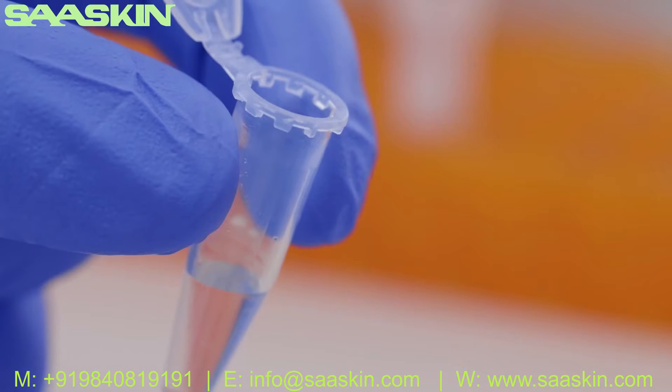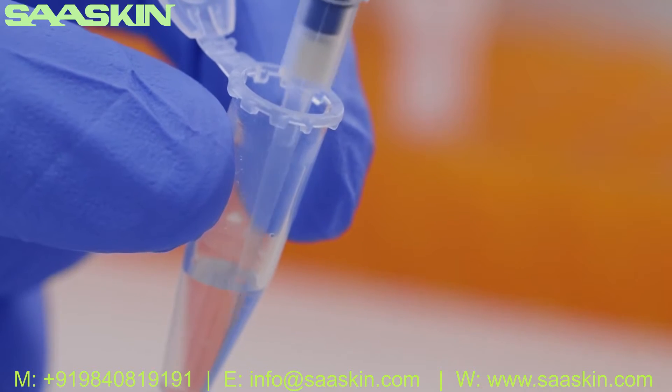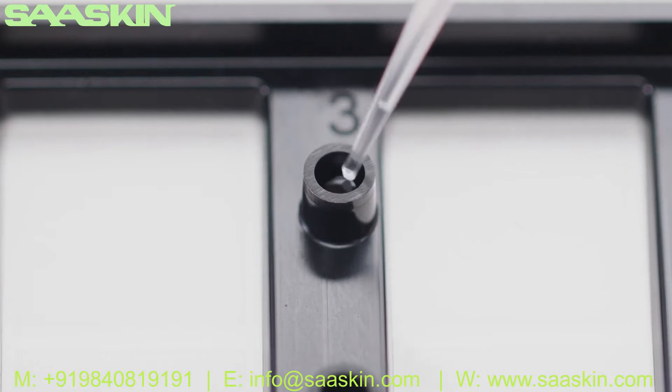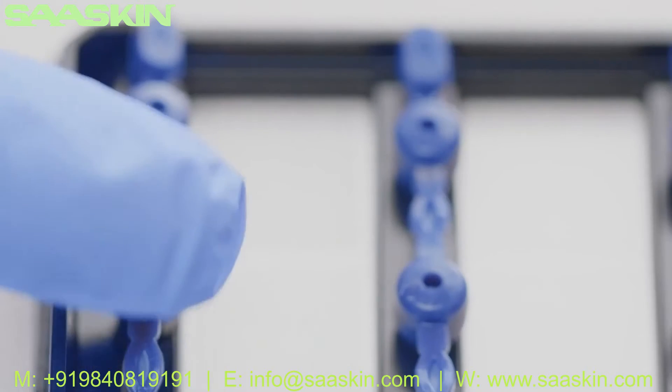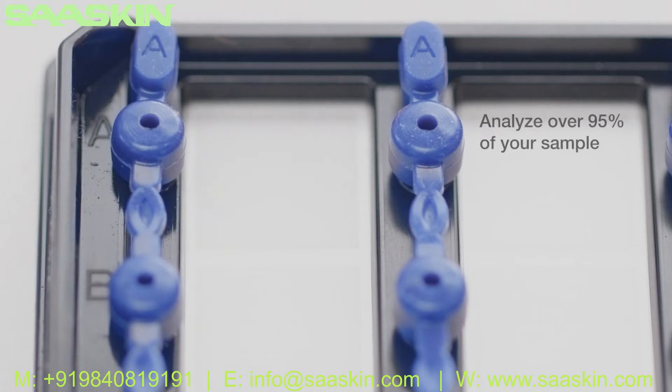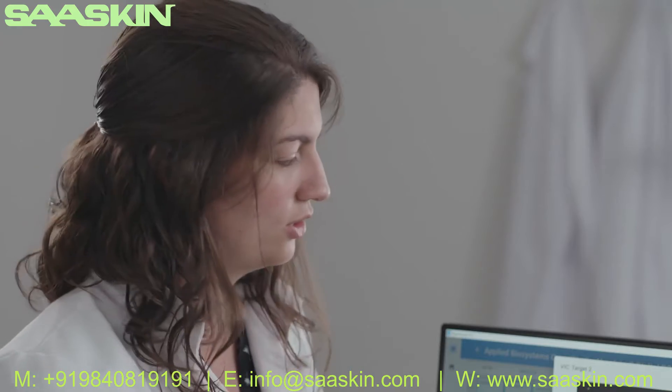The quantitation accuracy for any digital PCR system is driven by the amount of sample that is analyzed in a reaction. While some digital PCR platforms can waste up to 75% of your sample, the QuantStudio Absolute Q System consistently analyzes over 95%, so that you can see the whole picture every time.